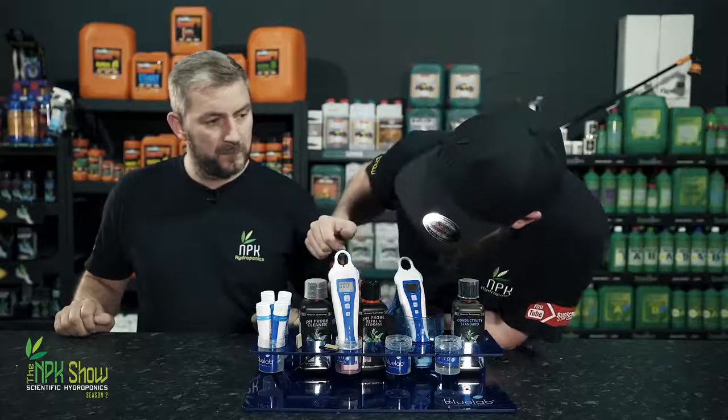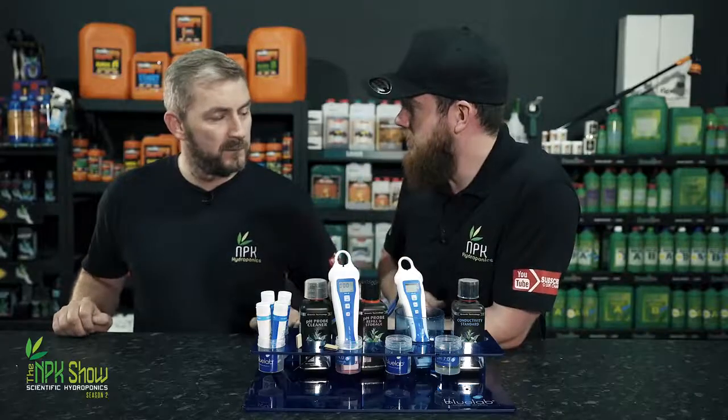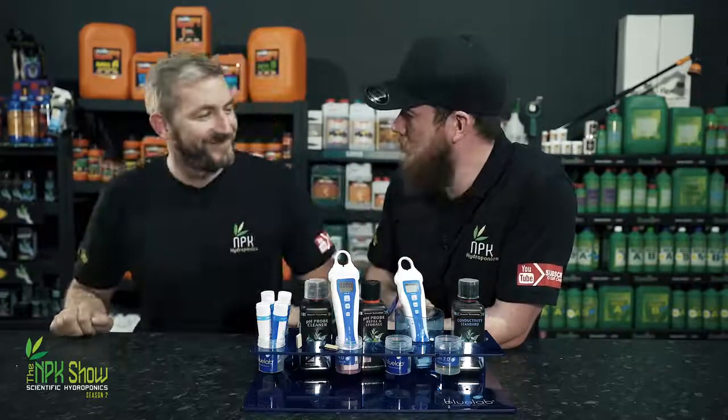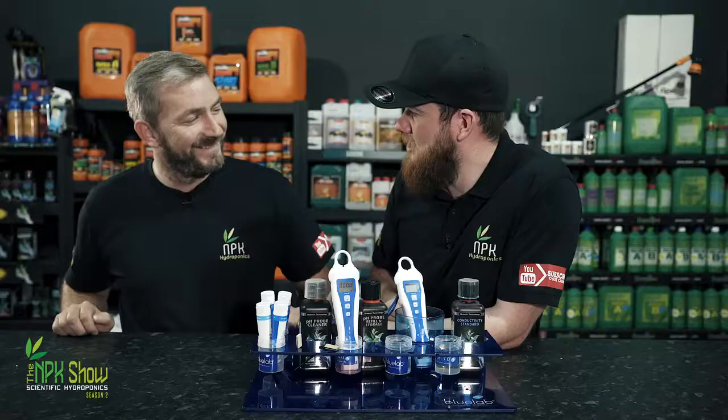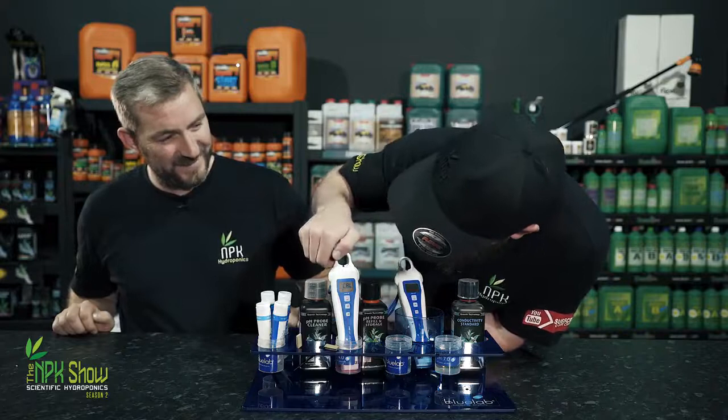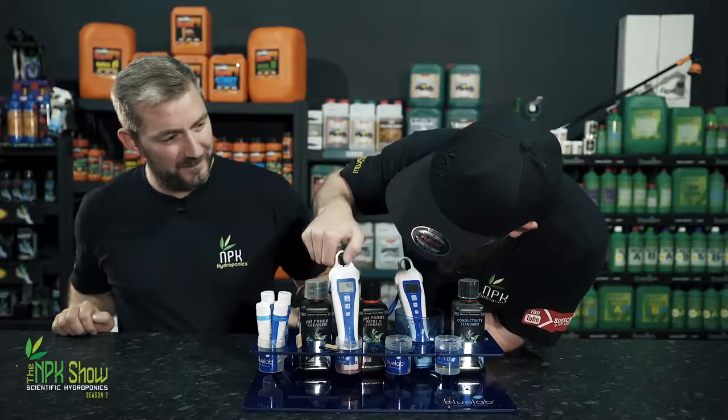I'm going to show you something with the cap of the pH pen. Patience. You've got to wait for it to be done, Barry. Stop being so eager just to move on to the next subject. I can see you itching to talk about this cap and how beautifully designed it is. And we're done. And is it on 4? And it's all happy days.